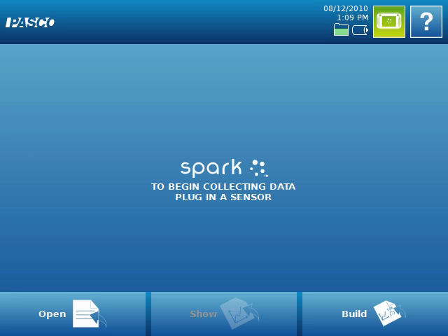So let's get started. To open a Spark Lab, we start on the home screen and select the Open button in the bottom left corner of the screen.